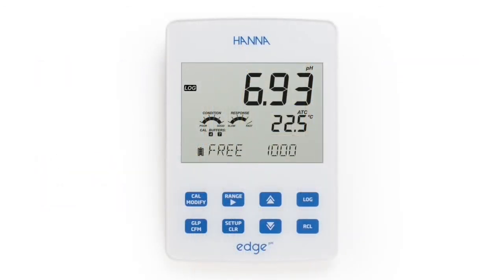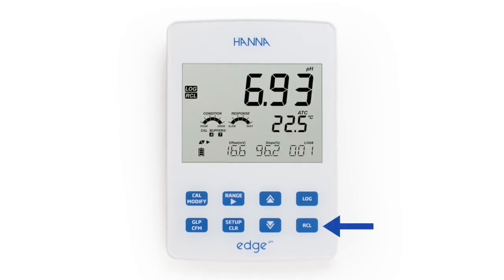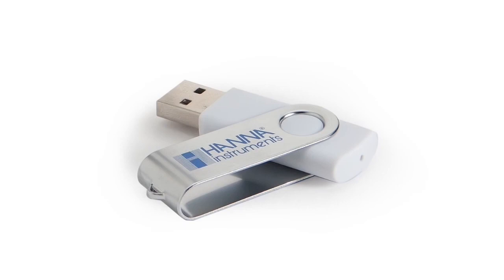Up to 1,000 measurement readings can be stored by using both log-on-demand and interval logging. A reading can be logged by simply pressing the log key. Stored data is easily recalled by pressing the recall button. These log measurements can then be transferred directly to a PC or stored on a USB flash drive.